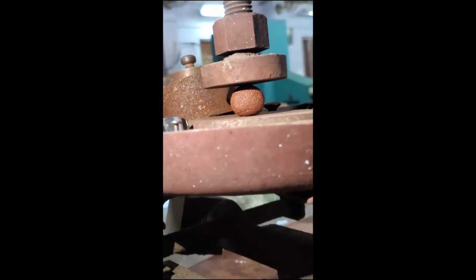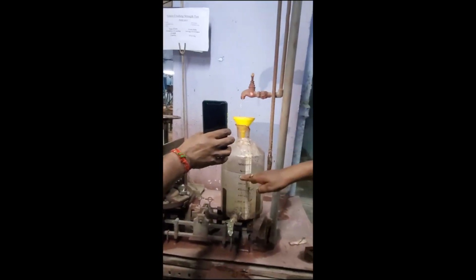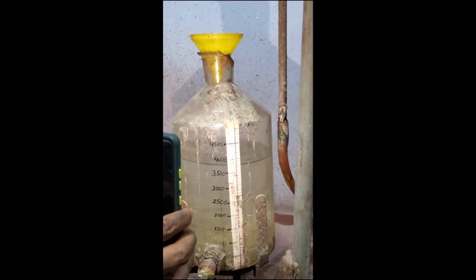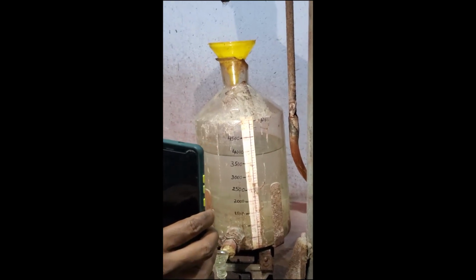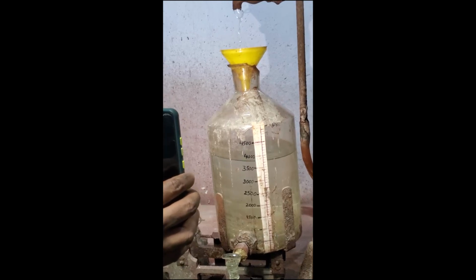Now it is touched. We are filling the water so the force will be applied. Initial reading we have already taken. That is 3800. And we are observing for pellet breaking.